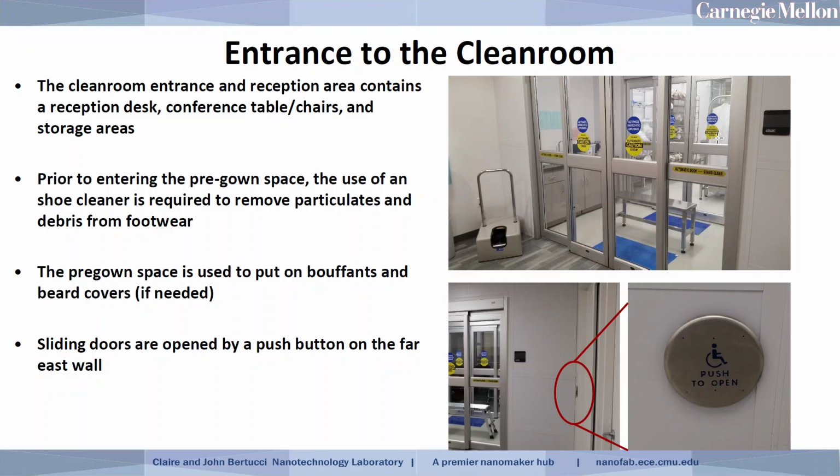So if at any point you're passing through here and you hit the button and the door doesn't open, likely that means the door to the lab is currently being used and is open. All you have to do at that point is simply wait. You don't have to continue mashing the button here. If you simply wait until the other door closes, then this door will open up.